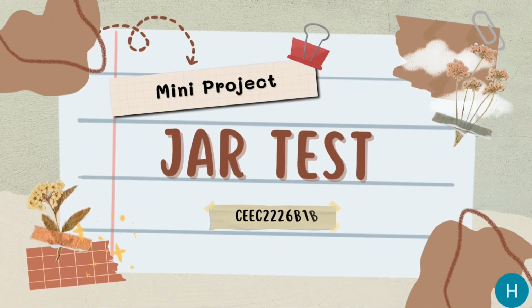Hi, we are from Group 2 from CEEC2226B1B. Our mini project for this subject is the JAR test.